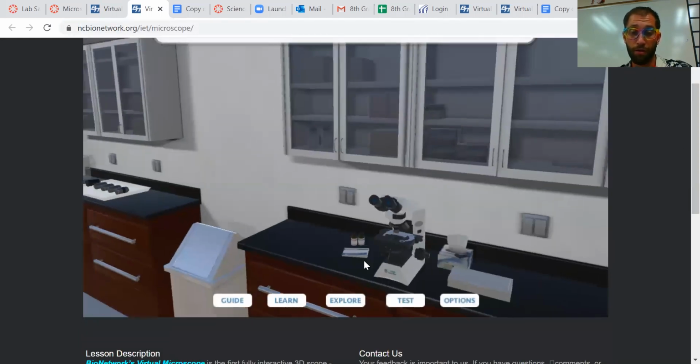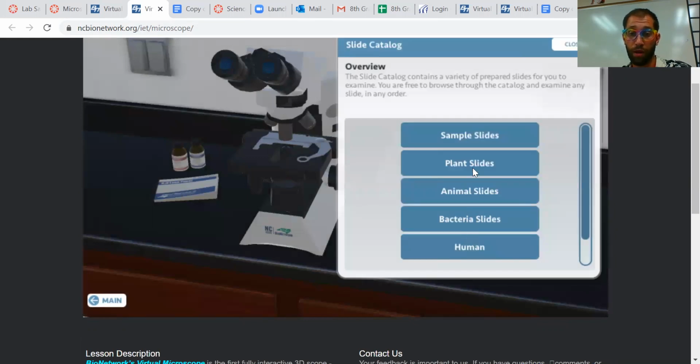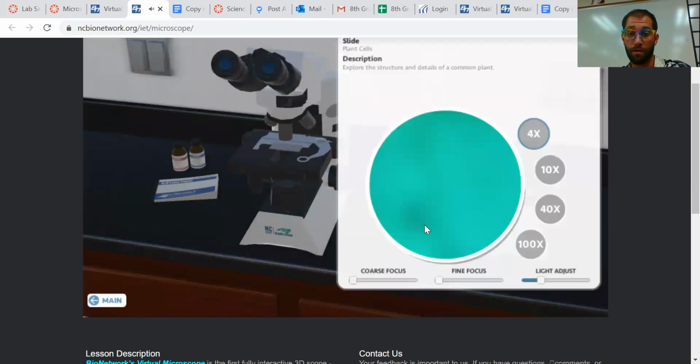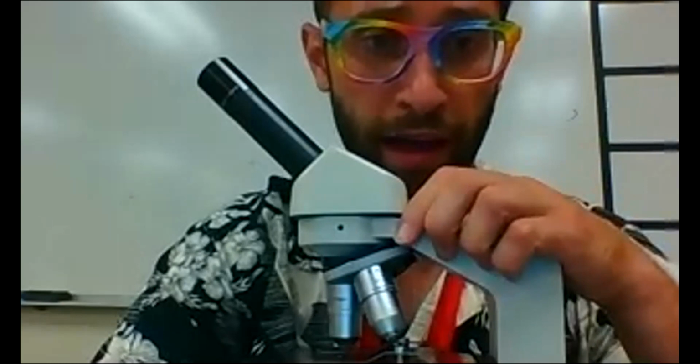You guys are going to, in our lab, click Explore. Once we are in Explore, we have plant and animal slides. Plant slide. We're going to use, you have the option of doing a plant cell or an onion cell. So, once we get here, one second here. All right, so we have our virtual lab.